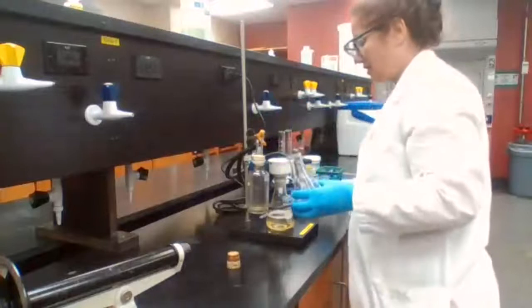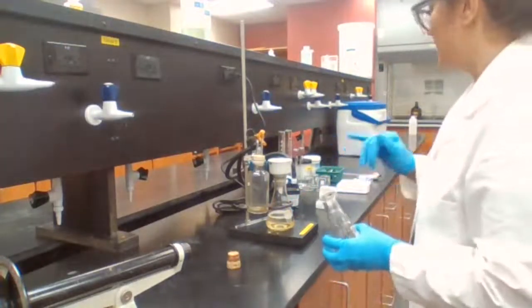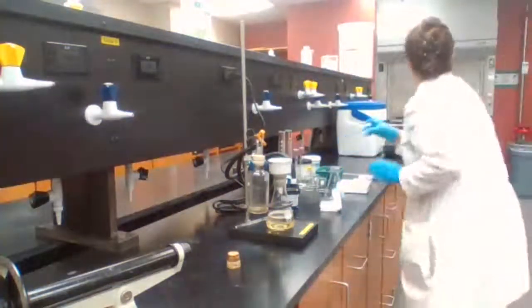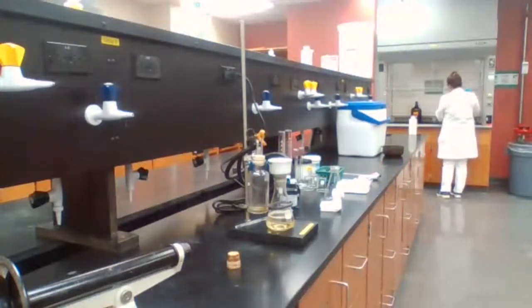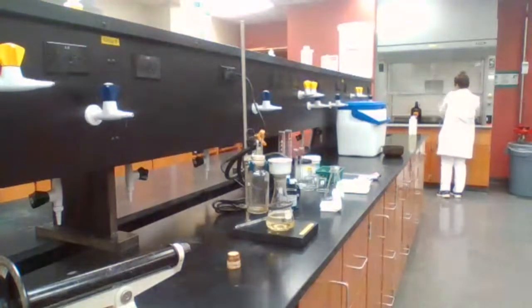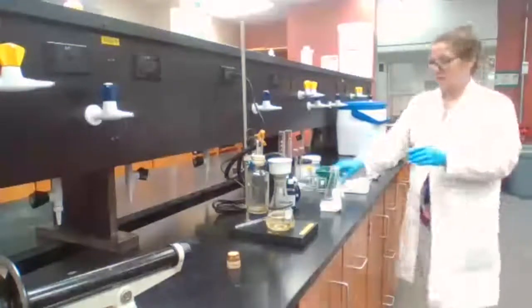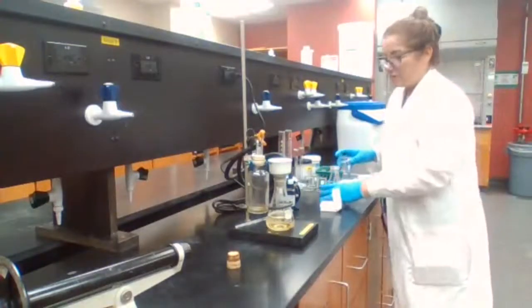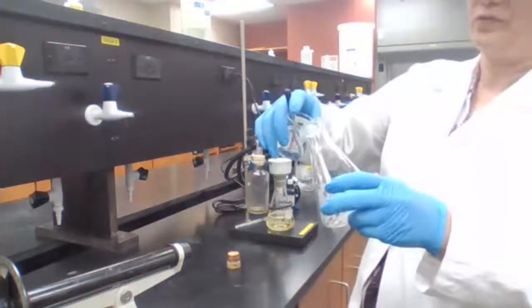And you want me to wash the crystals with methanol? Okay, get methanol. So instead of pouring the methanol over the crystals, I would add it to the flask.